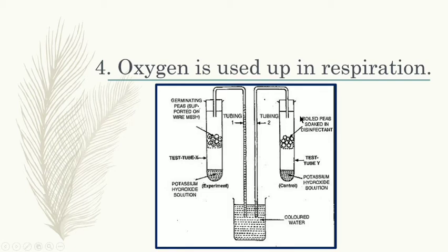Now after this we will seal the mouth of the test tubes with the help of a cork. So now the whole setup is ready. Now leave this setup for a few days. Now after that what shall we observe? Before we leave it for a few days, one more thing students you need to do: take the first reading of the level of water in both the delivery tubes, so we can compare the level of water afterwards. So the first level of water we have noted down, then we have left the setup for 3 to 4 days.